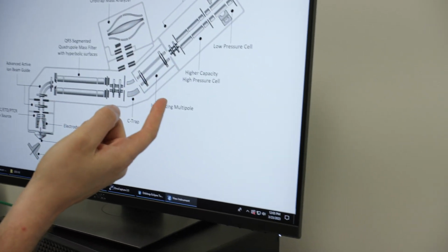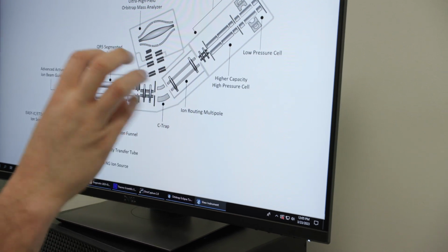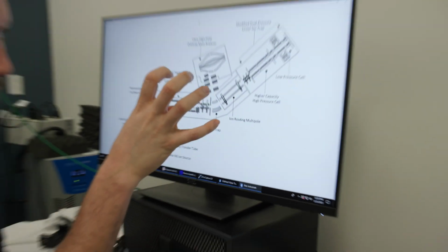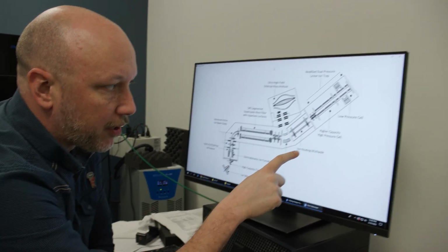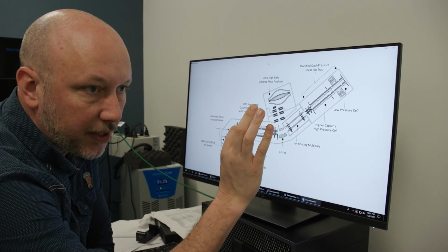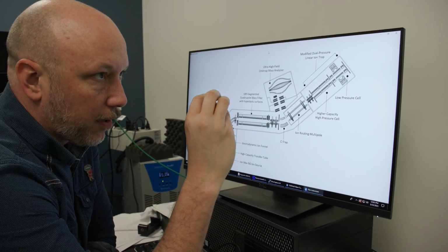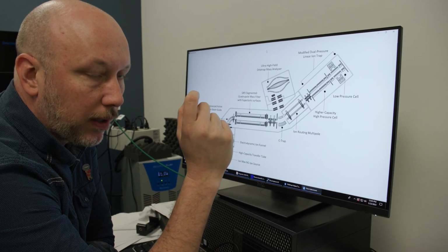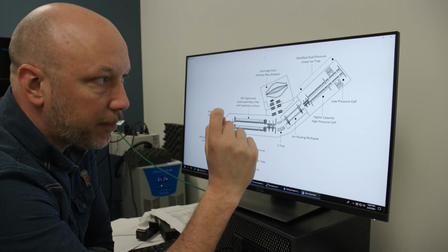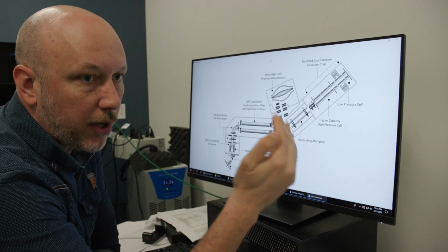One of the things we do in my lab is we study O-linked glycopeptides, so sugars that are added to proteins and peptides to modulate protein function. And with that, you can't collide them into gas molecules, because the bond between the amino acid that's glycosylated and the glycosylation itself is such a weak energetic bond that it breaks off, and we get no information about what amino acid was modified.